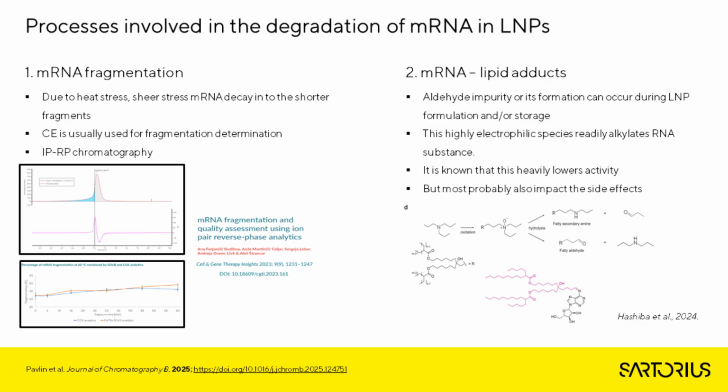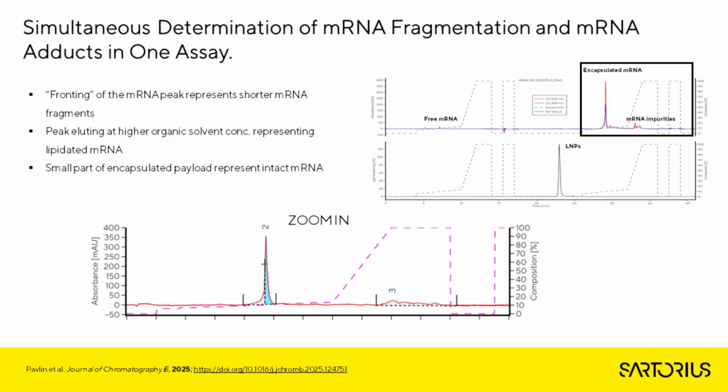I will not go into the presentation or discussion of how these adducts are formed, but I just want to emphasize here that these adducts heavily lower the activity of the LNP formulation, and they can cause different side effects of these vaccines. That's why it's really important that we have analytical techniques which can detect these adducts in the LNP formulation.